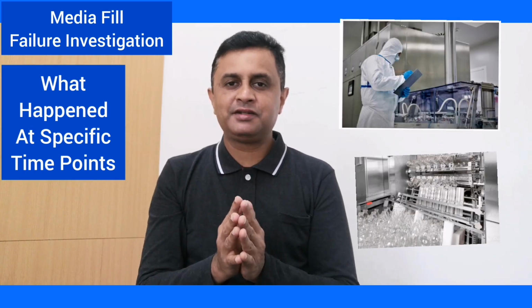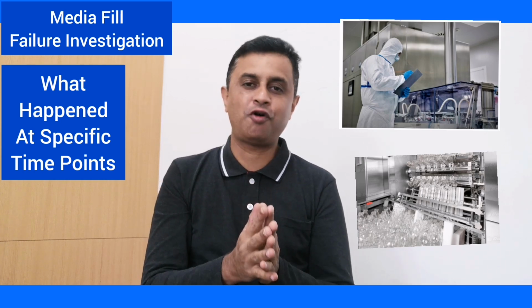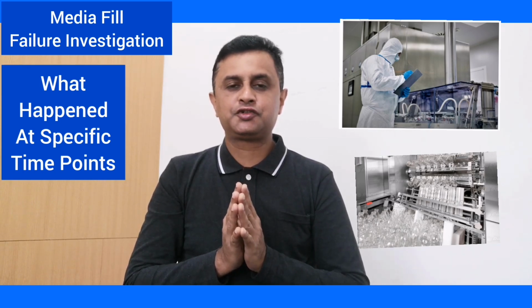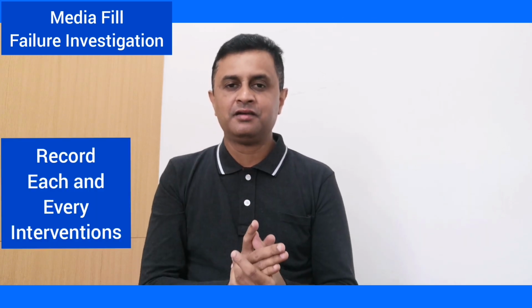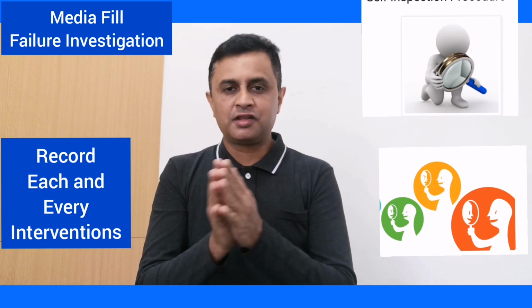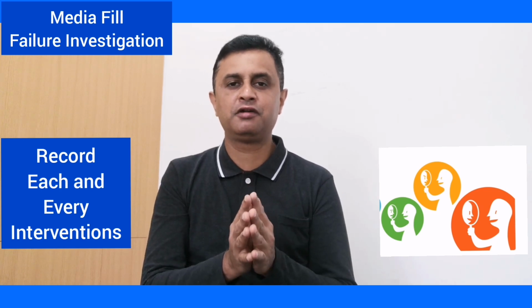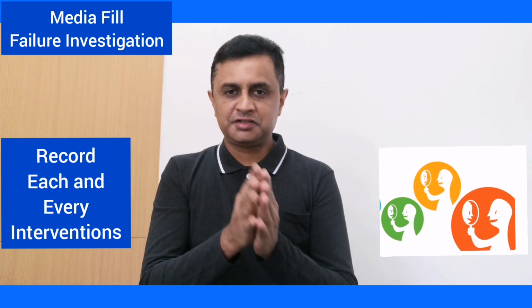If there is a certain new intervention or unusual practice observed during this time, then you can correlate it. For that it is most important that we record each and every intervention and each and every activity during the media fill. Video recording is also very helpful for investigation. It is not a mandatory regulatory requirement, but video recording helps to investigate and helps to train people. So this is one part.